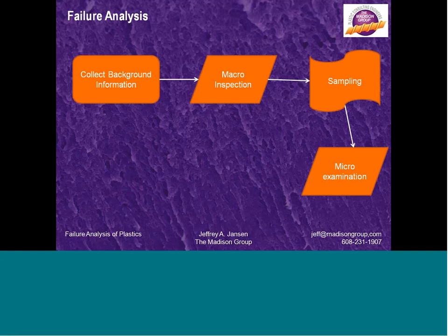Through the macro and the micro examination, we start to get a feel for what the mode of the failure was. How did it fail? Fatigue, creep, environmental stress cracking. We start to get that information, how the part failed.